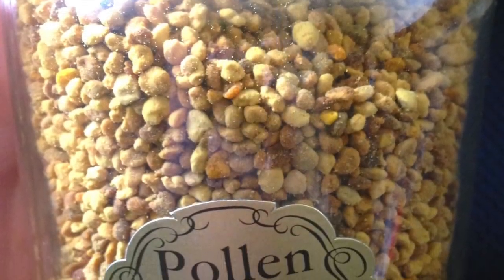I thought we might take a look at some pollen grains. We talked earlier about the pollen grains that come out of nutritional supplements.